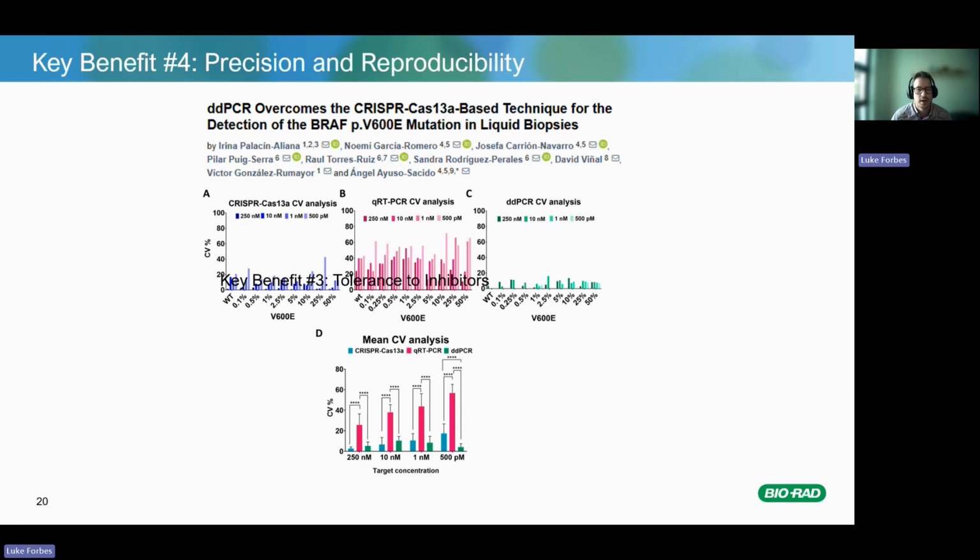It can also provide a much more complete picture of the tumor's makeup because DNA from all parts of the tumor are found in these fluids. However, current detection methods show that we do need a method that's more reliable, and they can be improved. Traditional methods are something like real-time PCR, Sanger sequencing, and next-gen sequencing, and they're used to find these mutations in both tumor tissue and liquid biopsies. However, like we stated, there is a need for a faster, more sensitive and comprehensive method to detect these mutations.